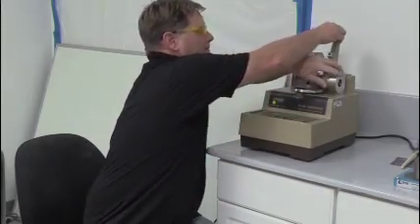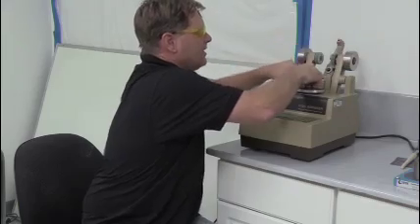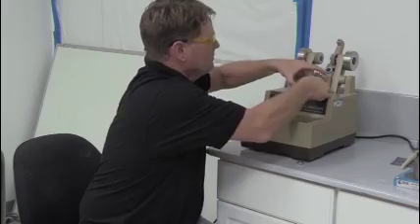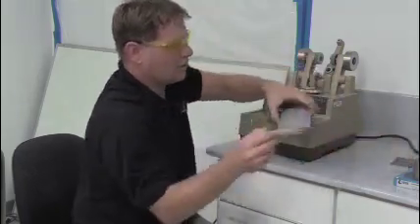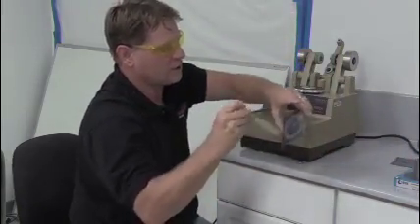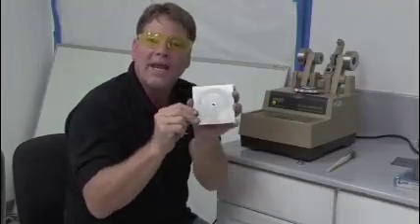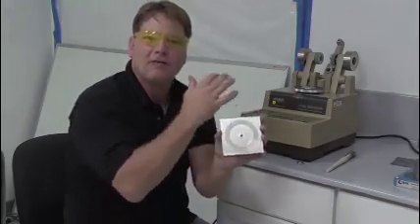You take this disc back off. You dust it off. Make sure all the dust is off of there and then you can see the tracks. And we go and weigh this again and we report the loss in weight from the Tabor wheel.